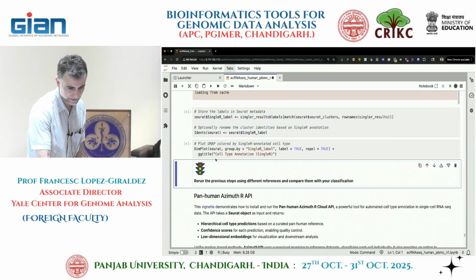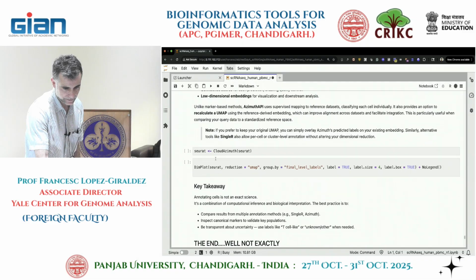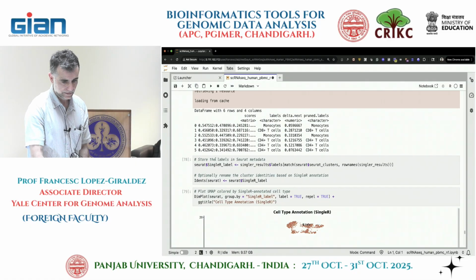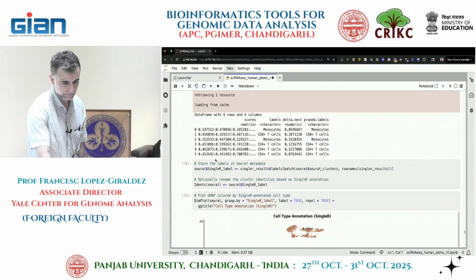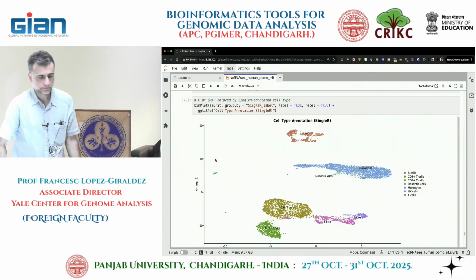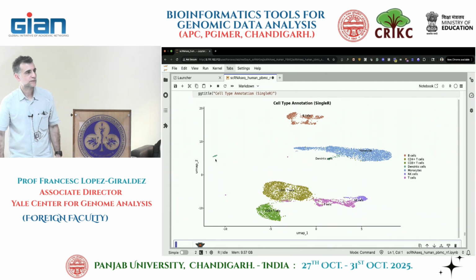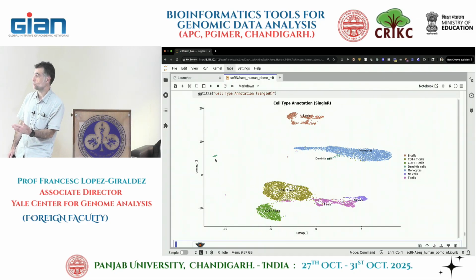I didn't know I added. Okay, this was the reference for PBMCs. It's a bit better in the classification. I guess we want more detail. This is giving us a little bit more detail.